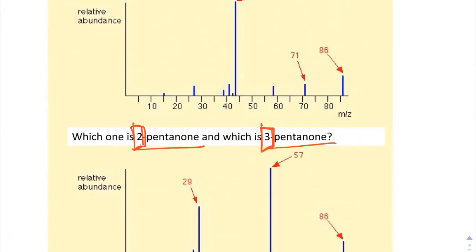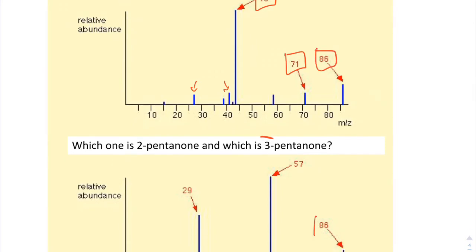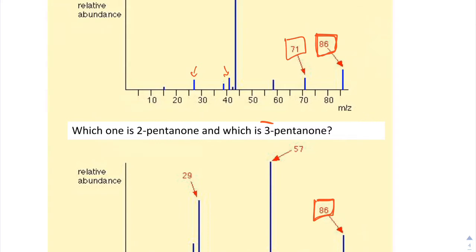So you'll notice that when we look at these graphs, they have some different peaks. They have some different readouts that are appearing here. So we've got some little ones down in here, but the major peaks that are showing up, we see them right here. Now you'll notice when you look at this, 2 of them match perfectly right off the bat, 86. Well, what you find is that the very last peak that ever forms, this one right over here on both of them, is the molecule full-sized.